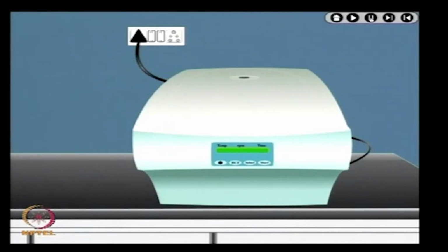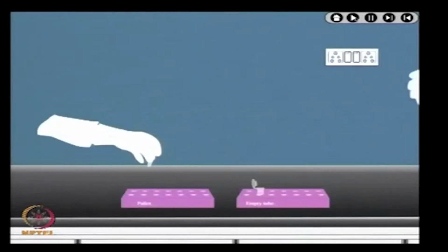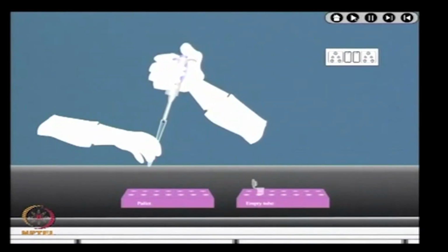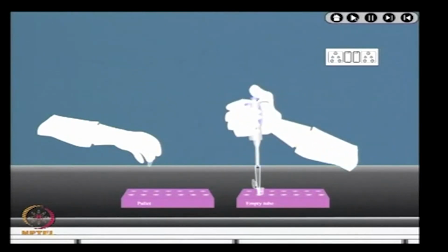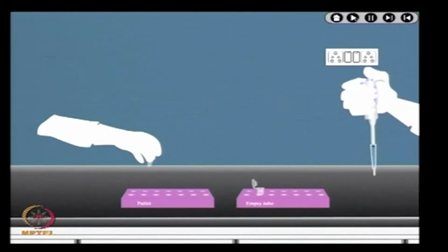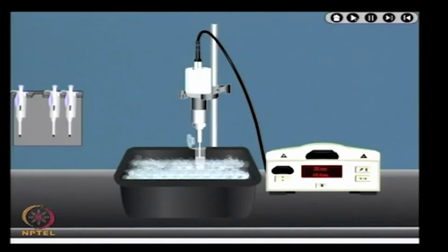Continue growing the culture till it reaches the mid exponential phase. The bacterial cells can be harvested by centrifuging at 12,000 rpm for 10 minutes at 4 degrees.